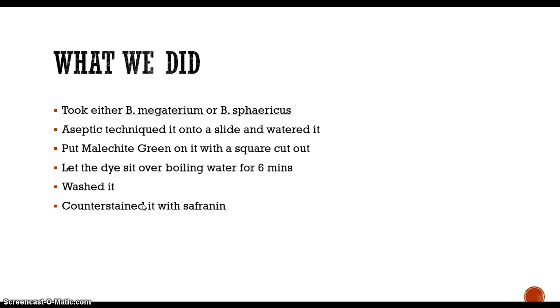So it's a very dangerous thing, kind of, and autoclaves are designed to beat endospore forming cells. That's why they have such high pressure and high heat, to make sure it destroys all cells, including ones that even form endospores.